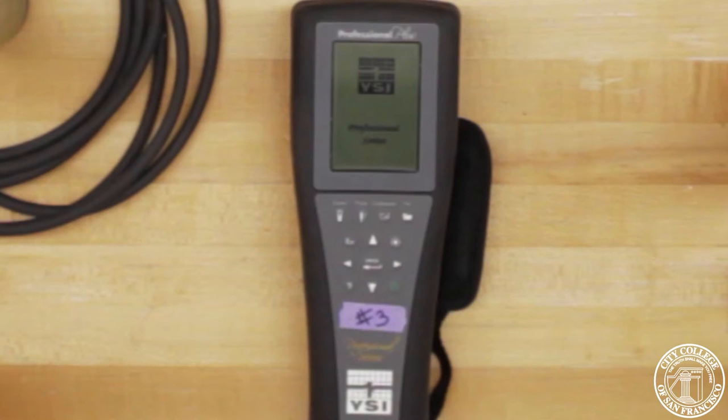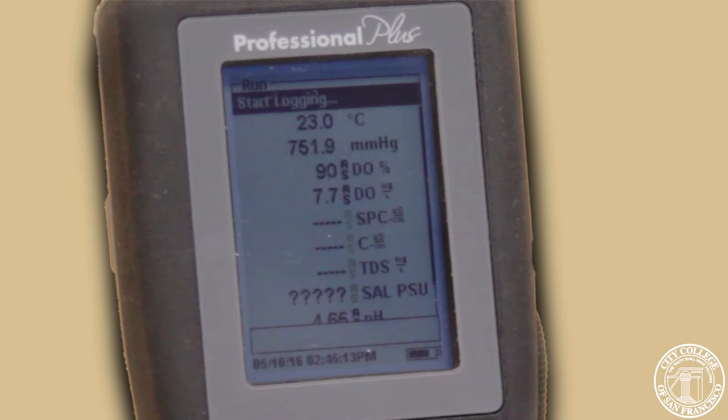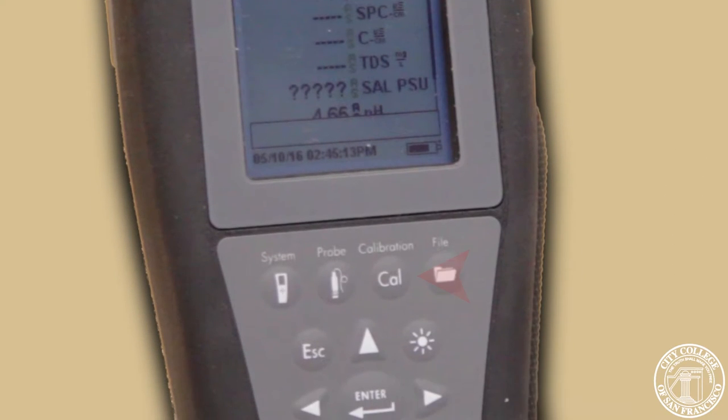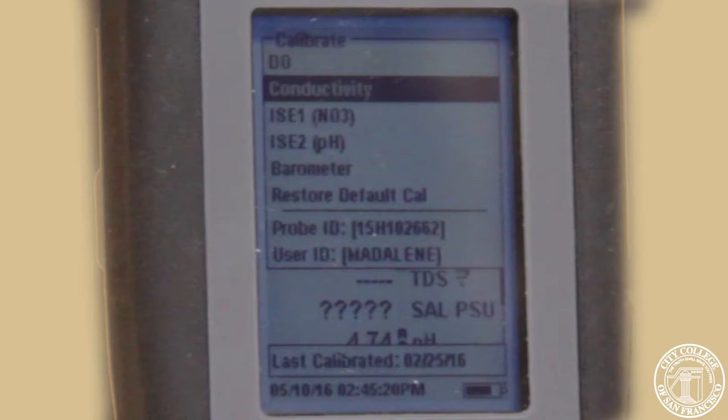Next, we're going to turn on our meter. Our meter is going to show the run screen. We want to calibrate instead. We're going to go down and select ISE2 pH. That's where our port is at.